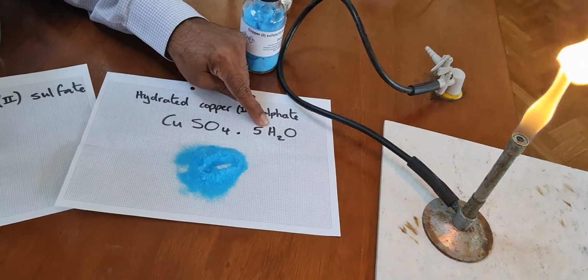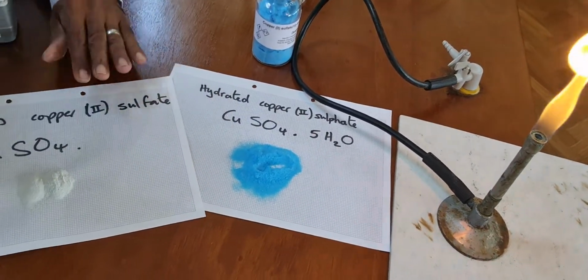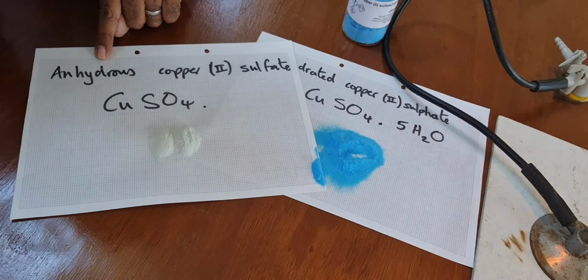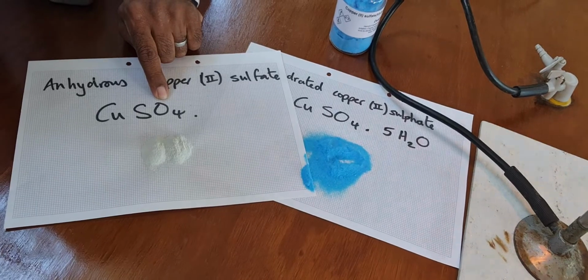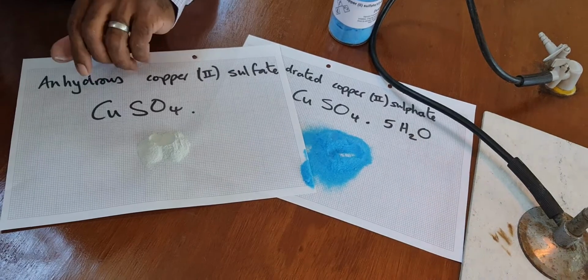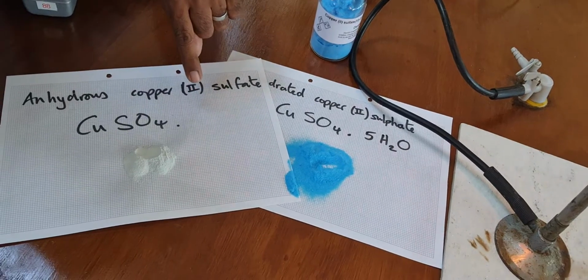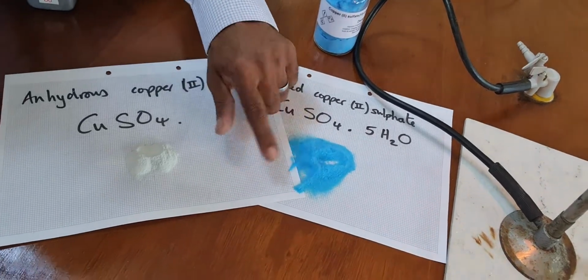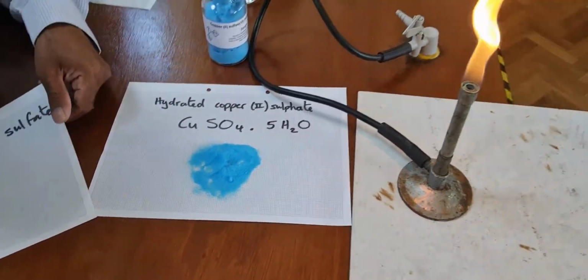If you remove that water of crystallization, then you have copper sulphate that has not got any water of crystallization. And that's called anhydrous, and that's this stuff here. So anhydrous copper sulphate is just CuSO4. There's no water in this formula. Can you see the colour? The colour of it is white. So you need to know about anhydrous. Without any water of crystallization, and without water, copper ions will then not be blue. They're only blue if copper ions and water are present together, and the hydrated variety is there.